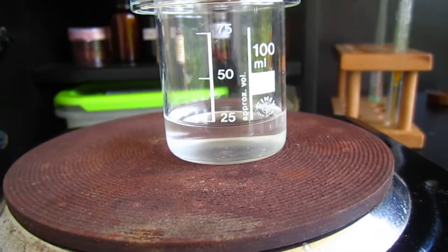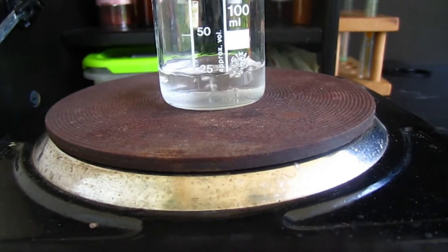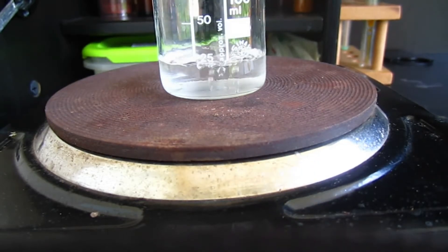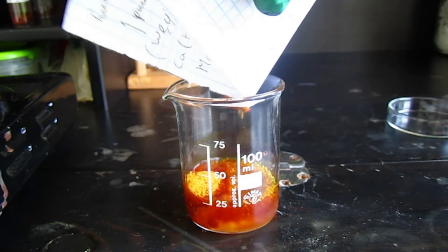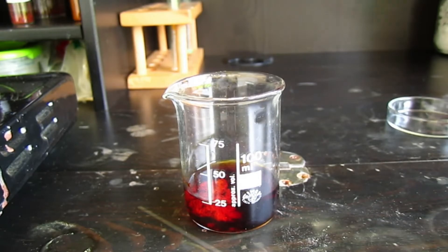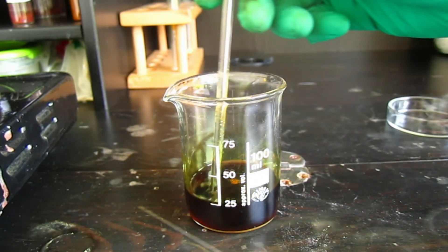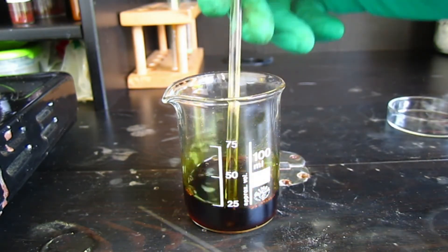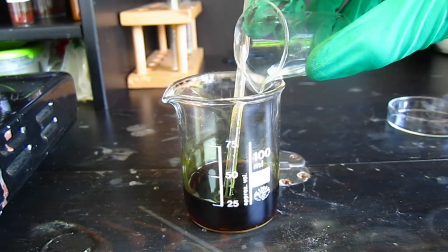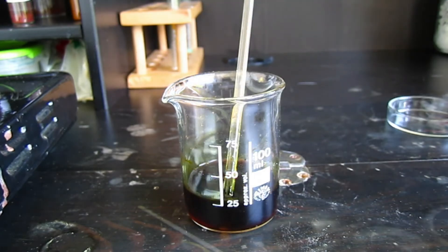So now I'm going to recrystallize this 1,3-diphenyltriazene from some ethanol. The alcohol started boiling, now I'm going to take it off the heat and drop in the triazene. So it dissolved pretty well and now I'm just going to add a few drops of water, and now I'm going to cool it immediately.